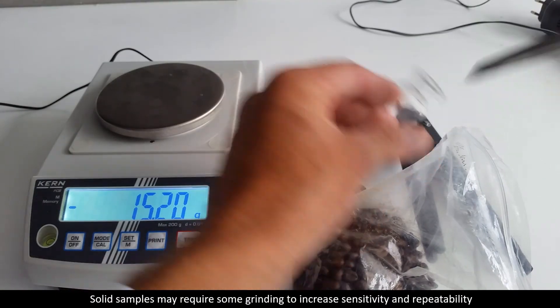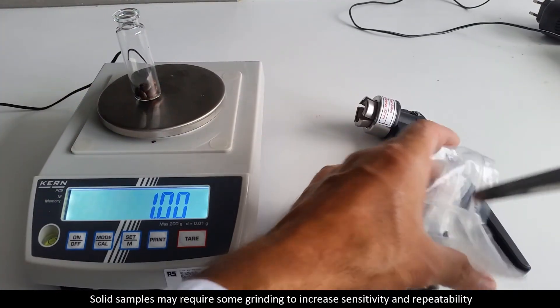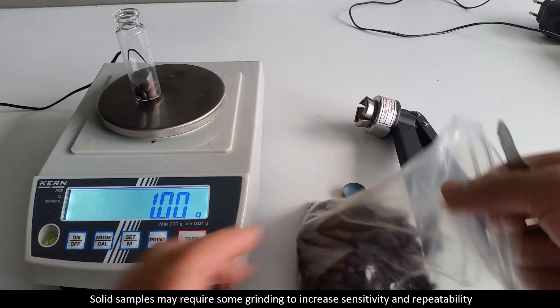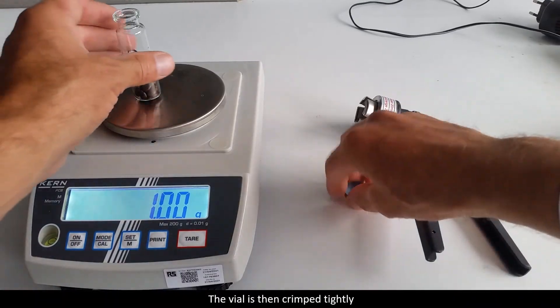Solid samples may require some grinding to increase sensitivity and repeatability. The vial is then crimped tightly.